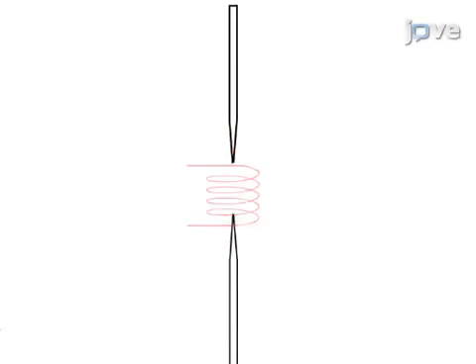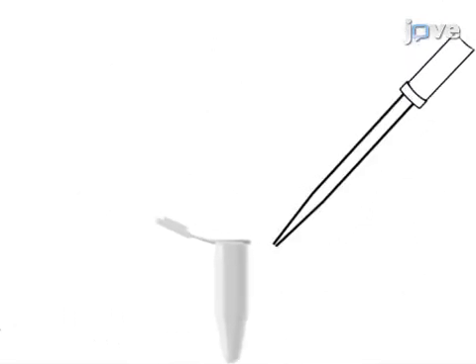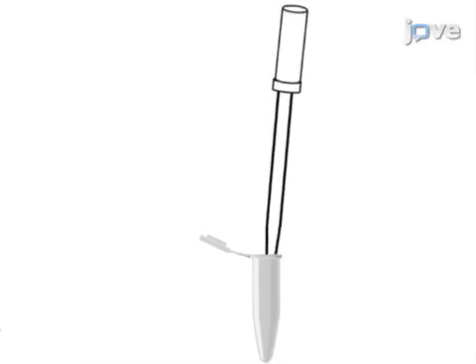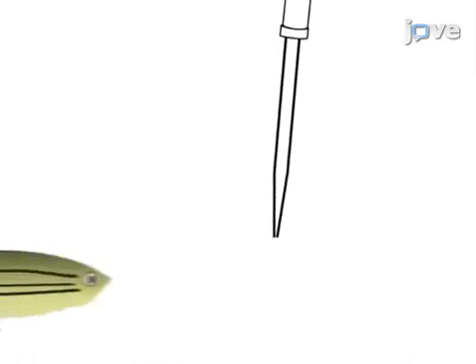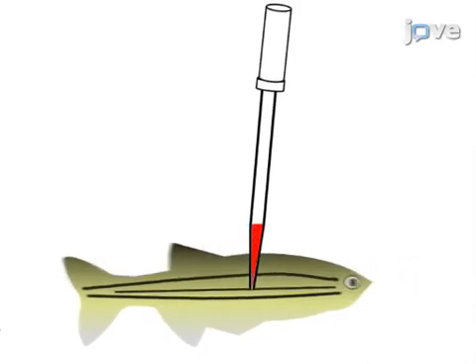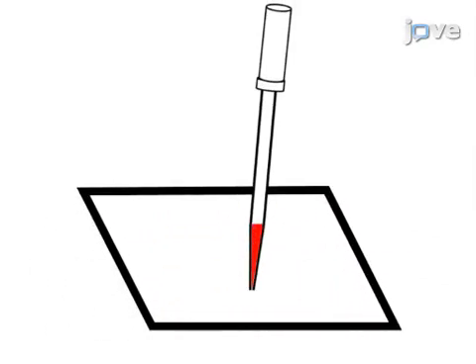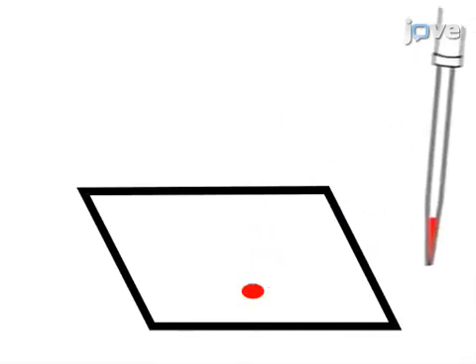This is accomplished by first pulling and cutting the tips of glass micro capillary needles. In the second step, the needles are heparinized and air dried. A needle is then inserted into the blood collection site and the blood is aspirated into the needle tip. In the final step, the blood is expelled from the needle into the appropriate receptacle for downstream analysis.